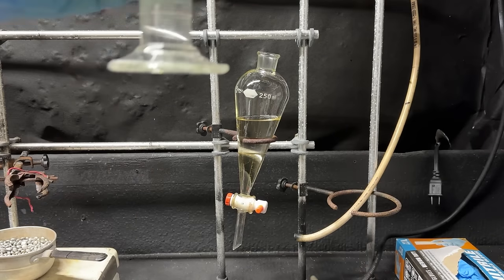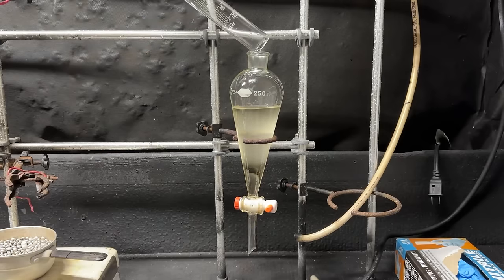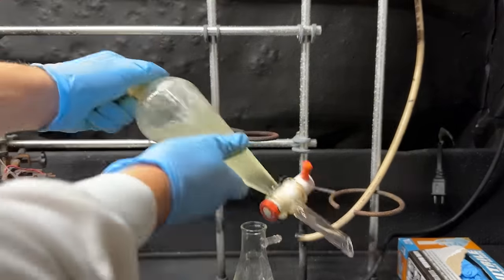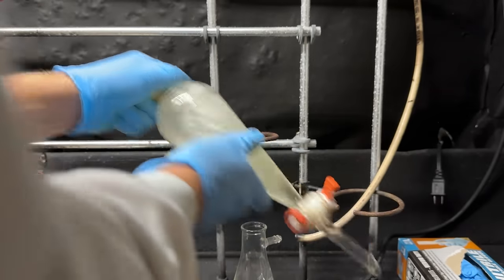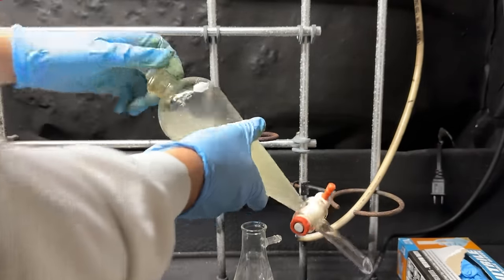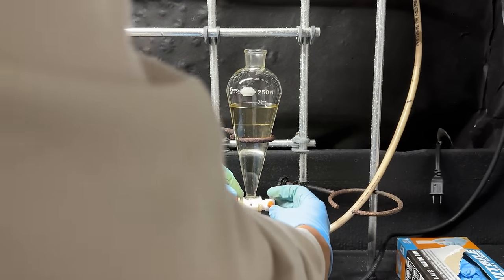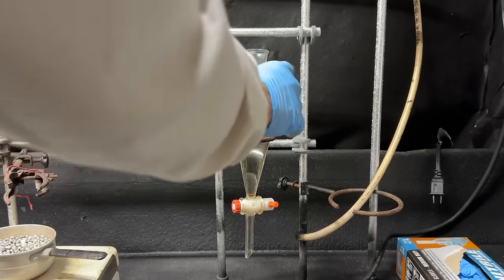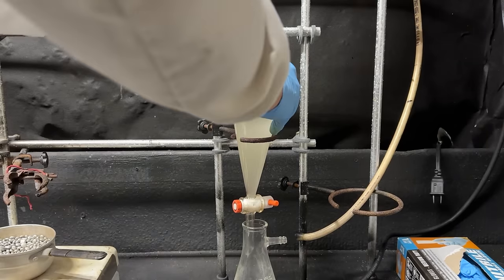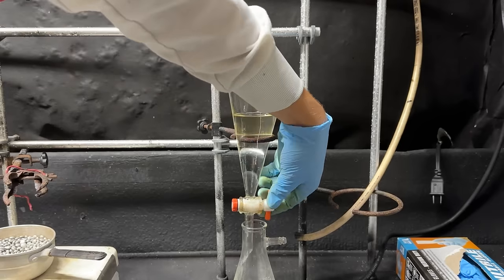Now I'm going to add 50 milliliters of distilled water — the water should not be miscible. We're going to shake and make sure to vent to get good extractions. Let's go ahead and pour off the aqueous layer. Again, we'll do another wash with 50 milliliters of water. These water washings are mainly to get rid of things like sulfuric acid, acetic acid, and things like that. Let's pour off our water layer.